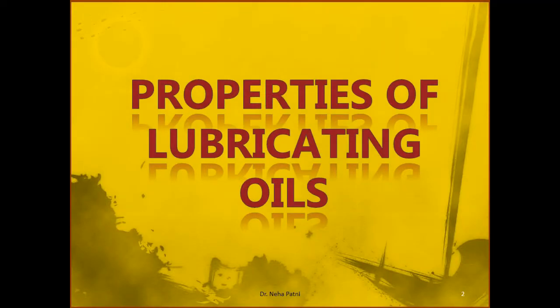Let us discuss some of the properties of lubricating oil. Up till now you have seen properties of semi-solid grease, like the last video which I uploaded, which was based on the drop point of the grease. So that was semi-solid. Now today we will see the properties of a liquid lubricant.